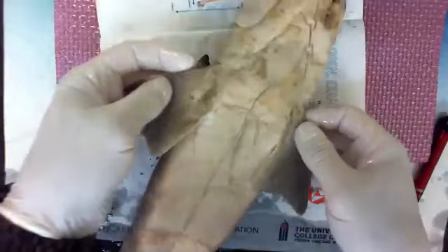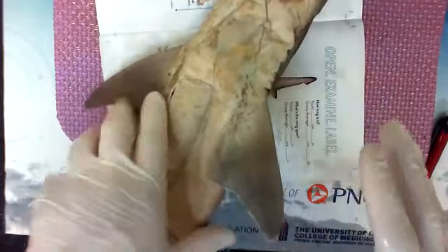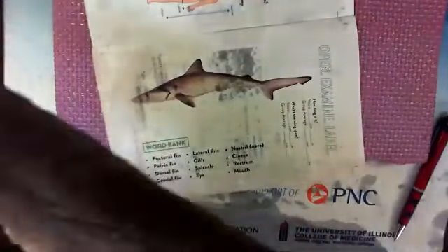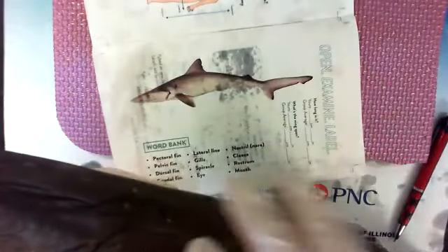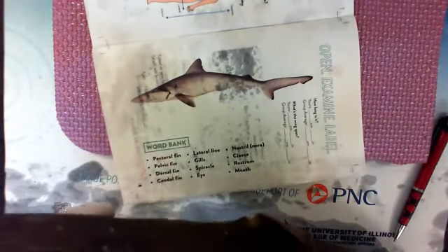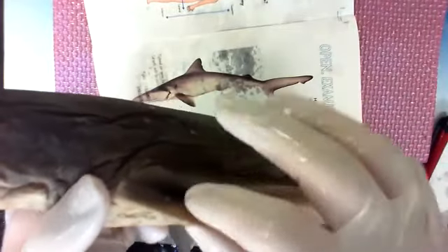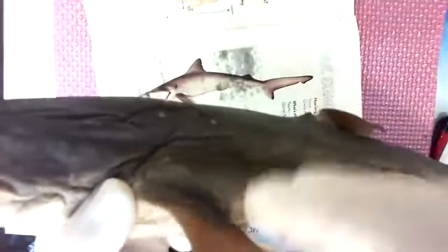These are actually unique because these fins are not like normal fish fins. These are cartilaginous fish. The shark group specifically doesn't wobble their fin like a bony fish. A bony fish is all the other fish that you're probably familiar with, like a bluegill or a catfish or carp or trout, swordfish, any of the other big fish. But with bony fish, they can move their fin around. If you look at a goldfish in an aquarium, when it's sitting still, it's waving its fin like that.